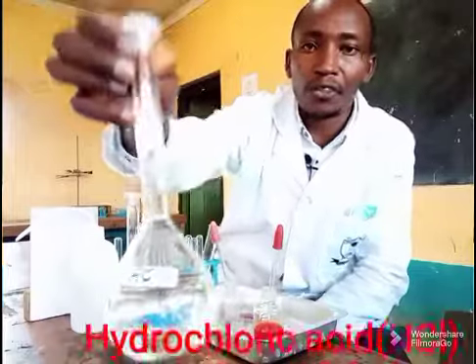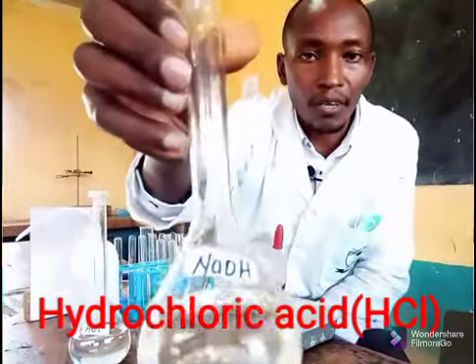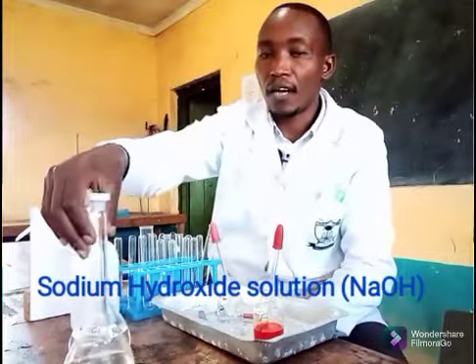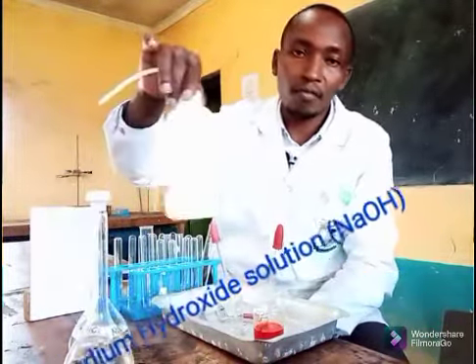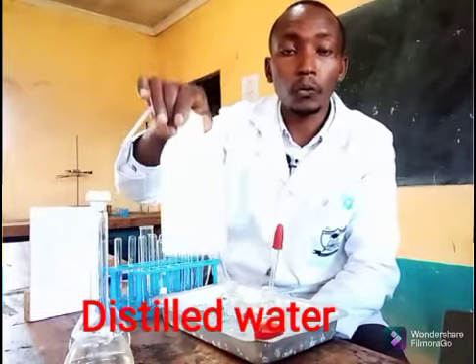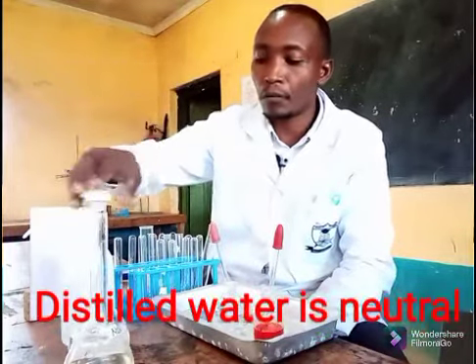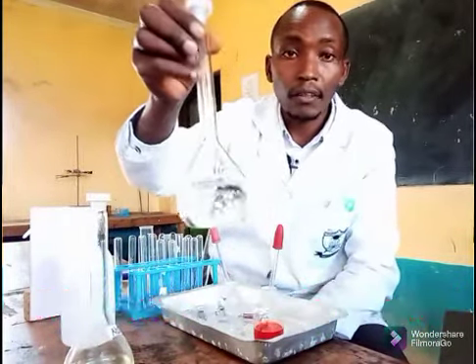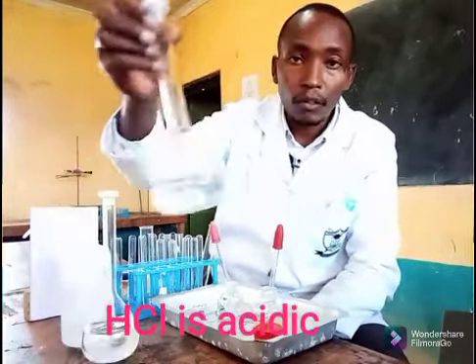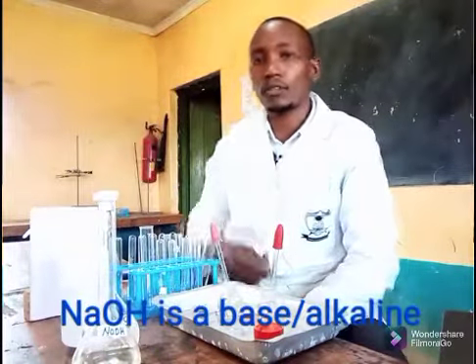This is hydrochloric acid, HCl. And I have another substance here, sodium hydroxide. And in addition, I have distilled water. As we all know, distilled water is neutral in nature. It is neither acidic nor basic. Hydrochloric acid is basically an acid. Sodium hydroxide is a base.